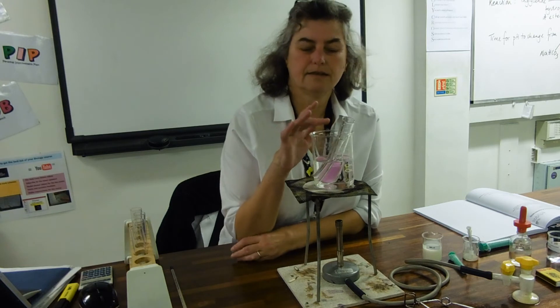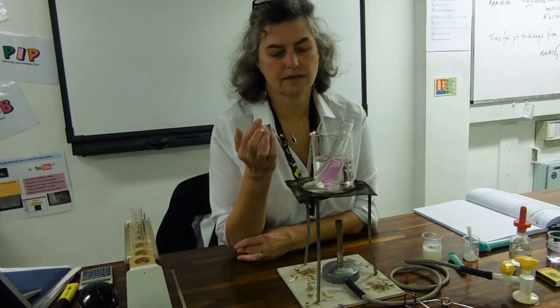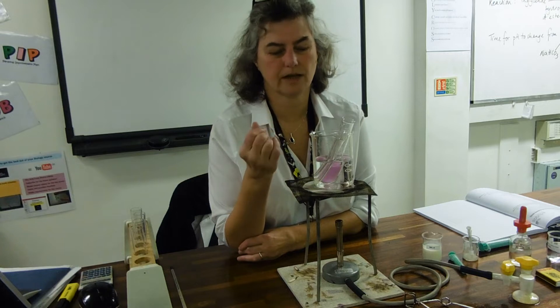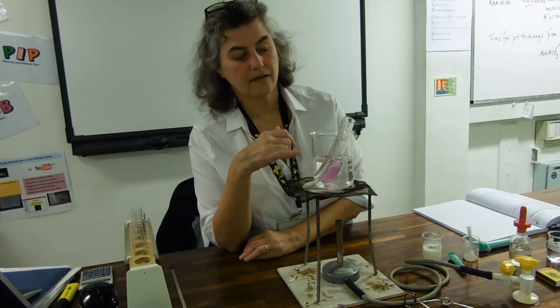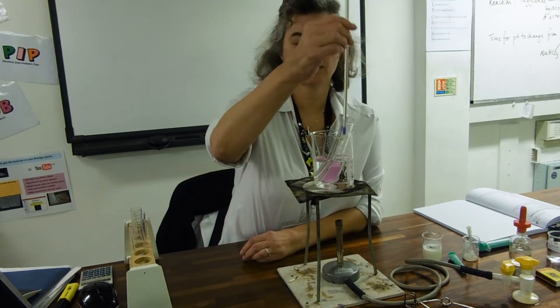Our substrate inside the test tube is fat — triglycerides. We're using full-fat milk so that the reaction will go faster. And the enzyme is the lipase. I'm just going to test the temperature of both of these solutions.